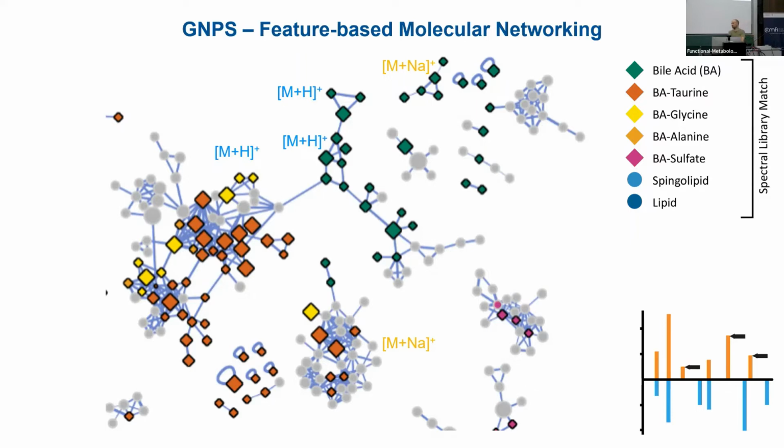Me personally, I very often use the peak height, because usually you have very narrow peaks and they don't vary between the compounds that you measure. Of course, everyone knows some compounds, even though they come at the same retention time, are more sticky and then have a weird shape. Then area is better, but usually if it's all very narrow, I use the height.